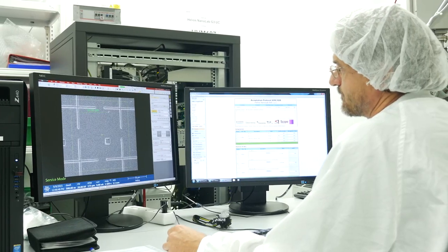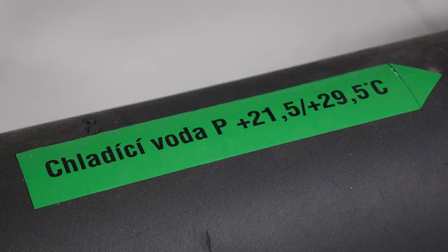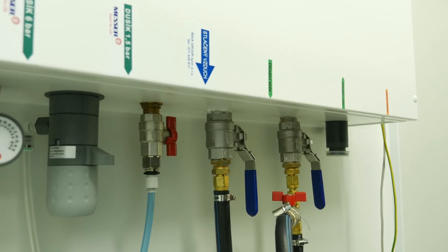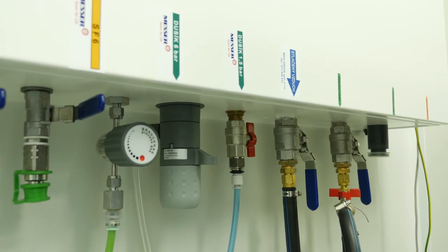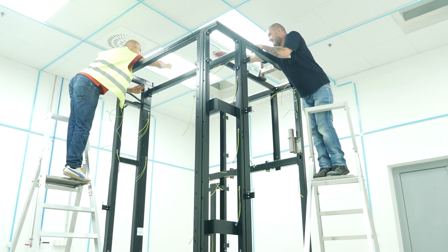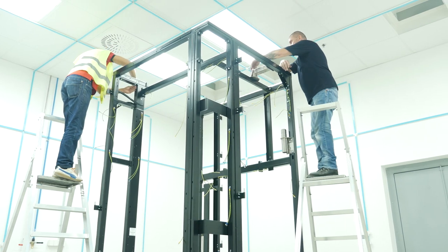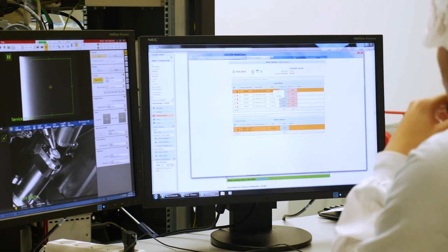While the device setup and its preparation is being finalized in FEI, according to the customer's wishes, even the customer must get ready for the microscope. A laboratory equipped with the electron microscope is expected to have stable water cooling, compressed air for valve control, gaseous and liquid nitrogen. So it looks as if the customer was building an entire special building for his new microscope. It's not uncommon, but let's not get ahead of ourselves.